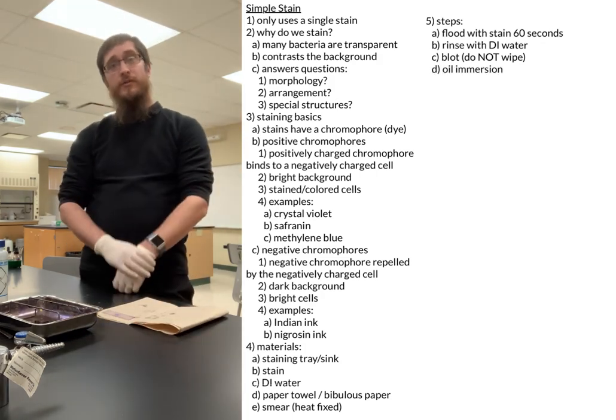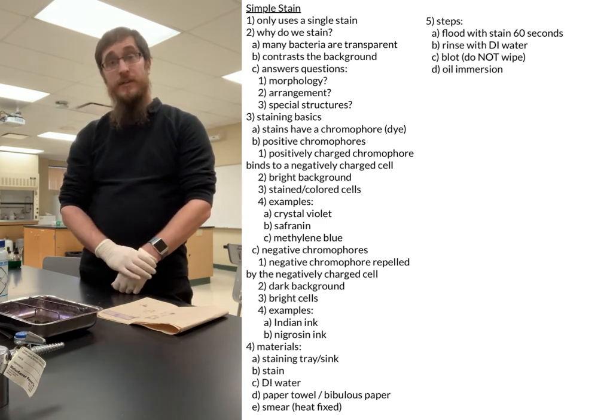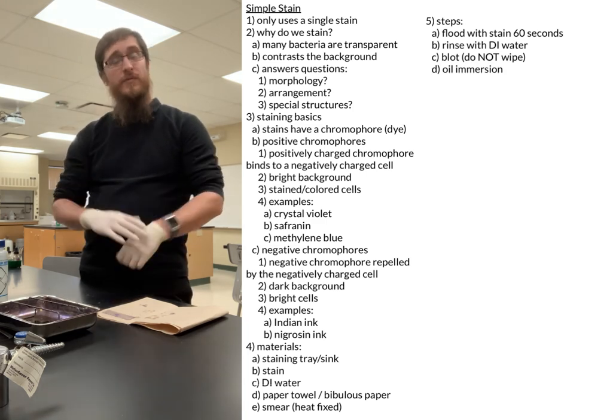And once you're done looking at it under oil immersion, you'll put it in the biohazard and get on to your next stain. But that should cover what we need to know for the simple stain.